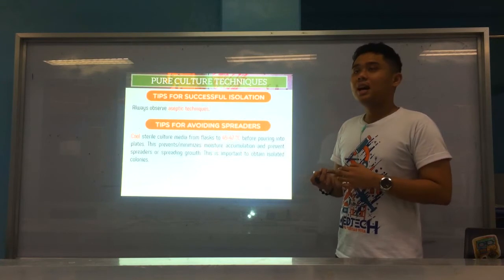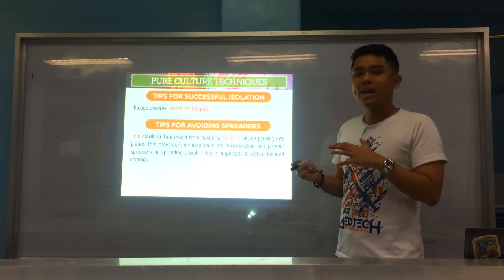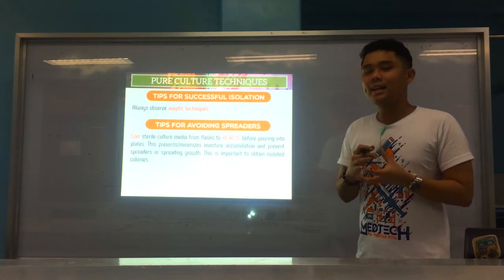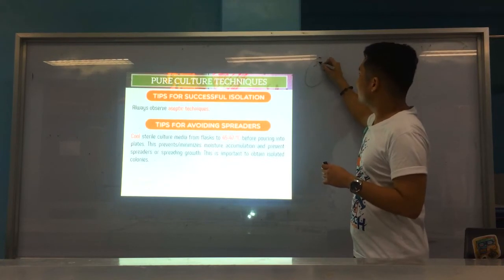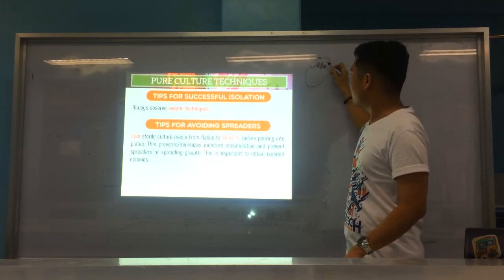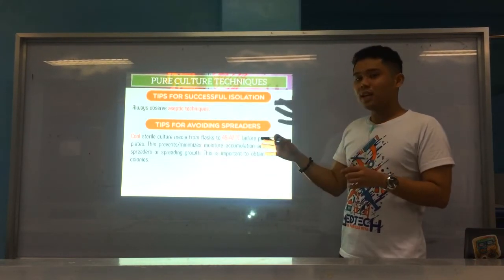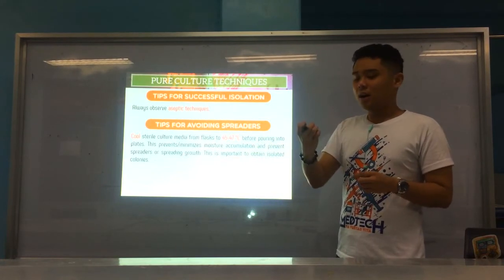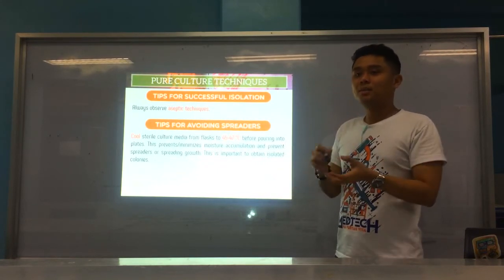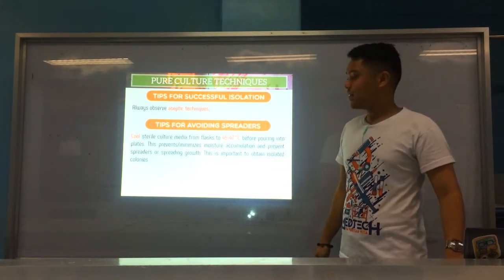Tips for avoiding spreaders. What you mean by spreaders is, if you do not cool the culture media to 45 to 47, once it is incubated, it can release moisture. Now this moisture, if your culture media is wet, and then because of the moisture, colonies that grow will spread because of the moisture in the culture media. So what you have to do is, again, cool it to 45 to 47 before you dispense it into plates. Because again, the point is, the spreaders come from the moisture from the culture media, and the colonies spread because of the water or the moisture. Okay, that's for avoiding spreaders.